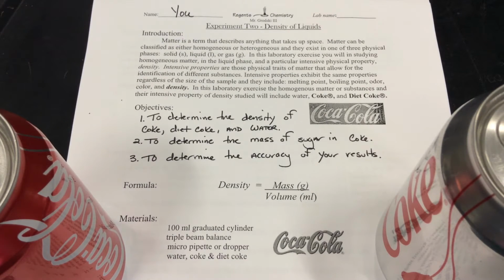In the density of liquid labs, we're going to calculate the density of water, Coke, and Diet Coke, and we're going to determine and calculate the number of grams of sugar in a can of Coke based on the premise that regular Coke and Diet Coke have the same ingredients minus one has sugar and one doesn't. Under that premise, we're trying to calculate how many grams of sugar, and this will help us with calculations and conversions and significant figures and measurements, and it's the final lab of the first module.